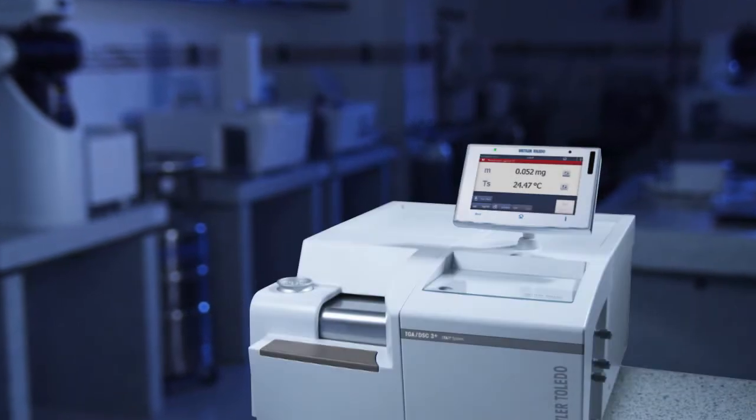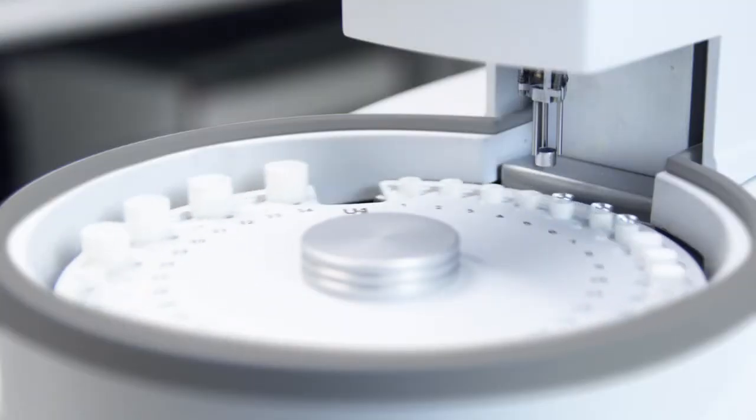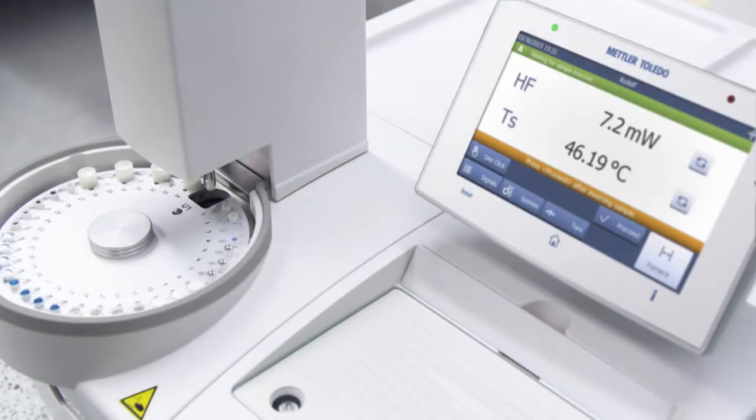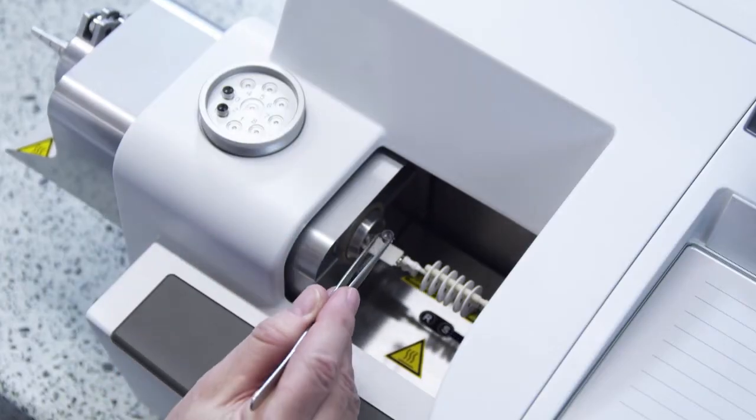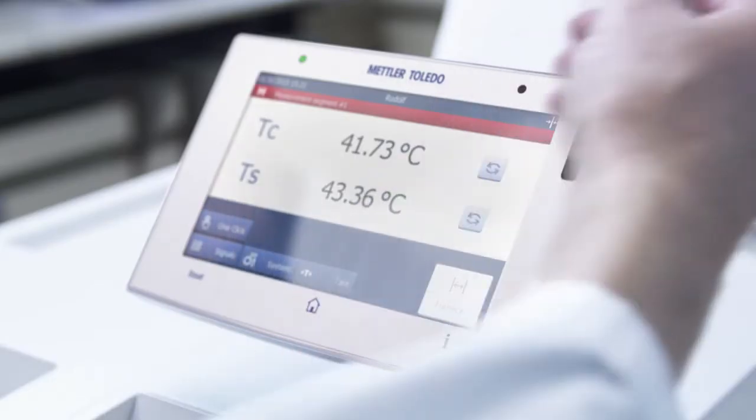The different TGA DSC models can be automated using a sample robot. It operates reliably and safely 24 hours a day, seven days a week. The ergonomic design of the instrument and features such as SmartSense guarantee ease of use and operation free from mechanical disturbances.